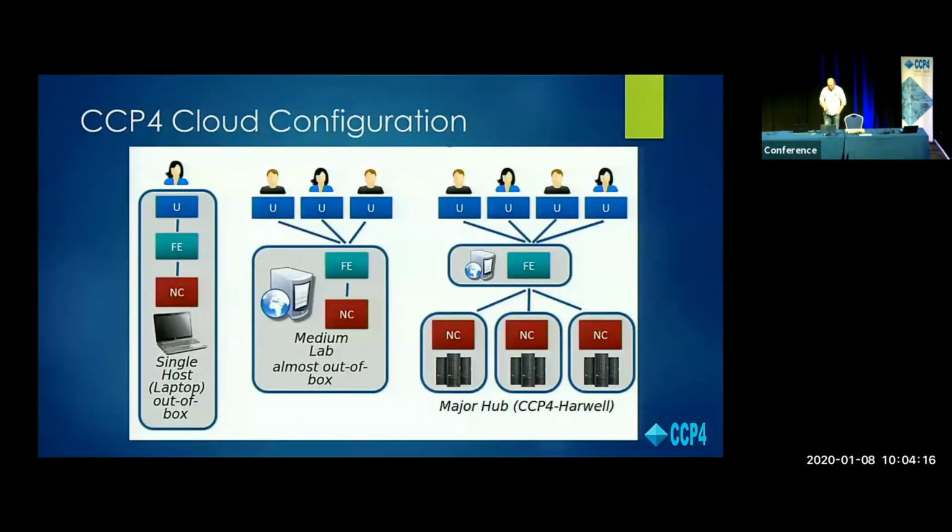So the main aim of where it's going to be used is on the cloud. There are 3 ways you can actually use it, but it's not meant as a direct replacement for CCP4i2. It's mainly aimed at installations in big institutions, so places like the Crick and synchrotrons like Hamburg have installed it and used it as a resource for their users.